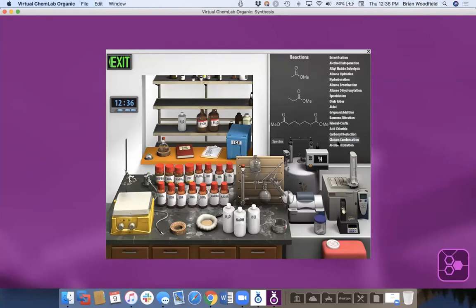So here, what we're doing is we're giving a list of these named reactions, and the structures you're seeing are the available starting materials for each one of those reactions. All right, so it's not meant to say, hey, if I pick Grignard, am I only going to be able to do a Grignard reaction? The answer is no. This just selects the starting materials you have available to you in the lab.